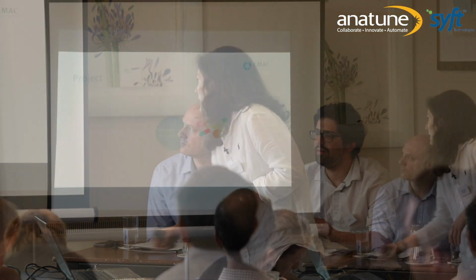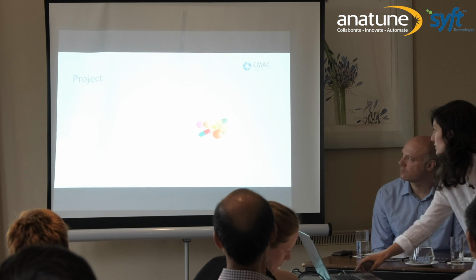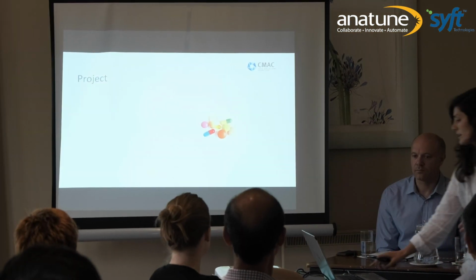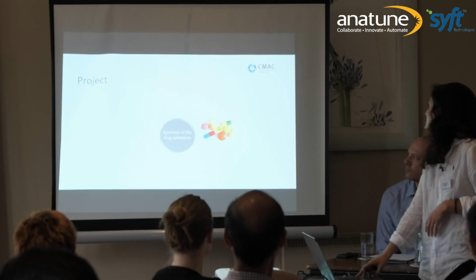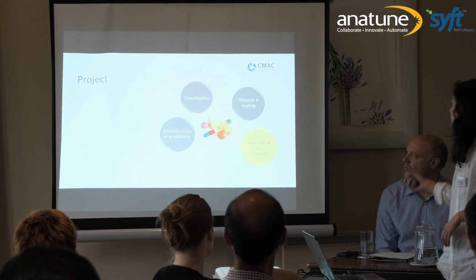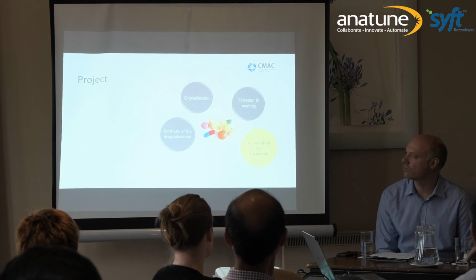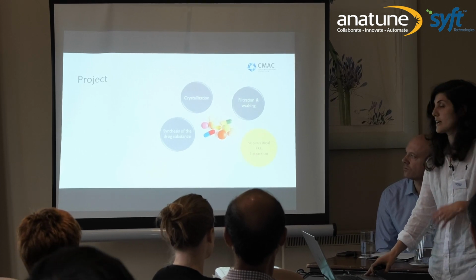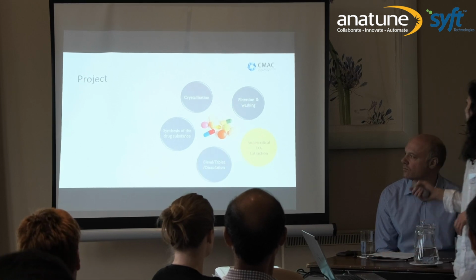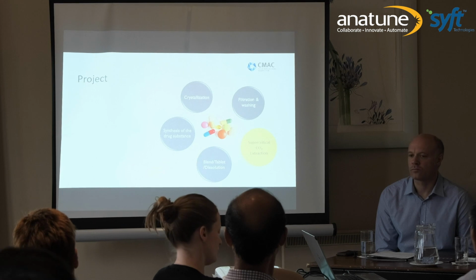So, as everyone knows, the production of a drug product is a multi-step procedure that includes synthesis of the drug substance, crystallization, filtration and washing. And here is where my project fits in the pipeline, and supercritical CO2 extraction comes to replace conventional drying. And the last step is formulation and dissolution.